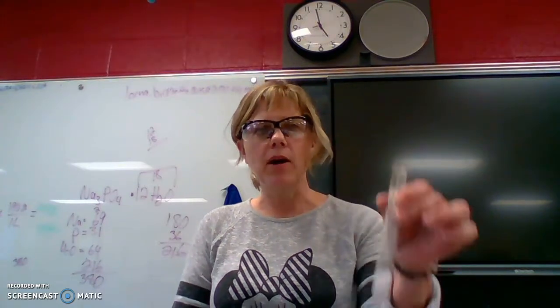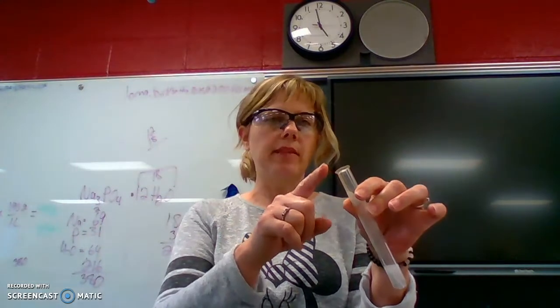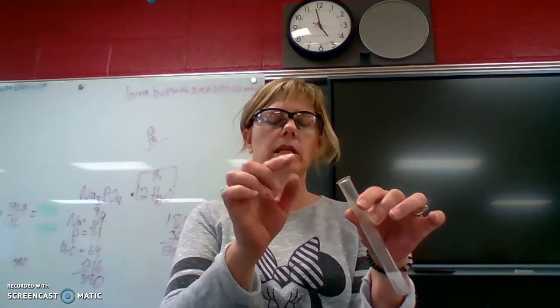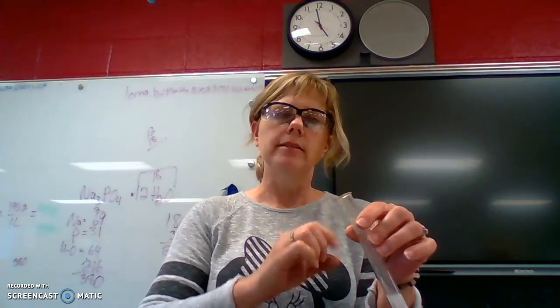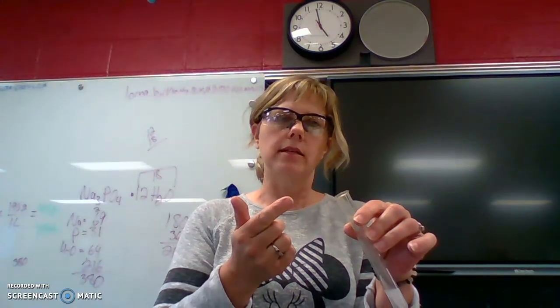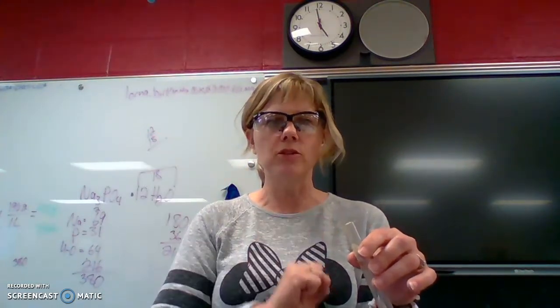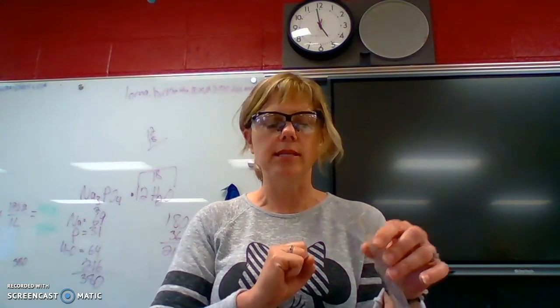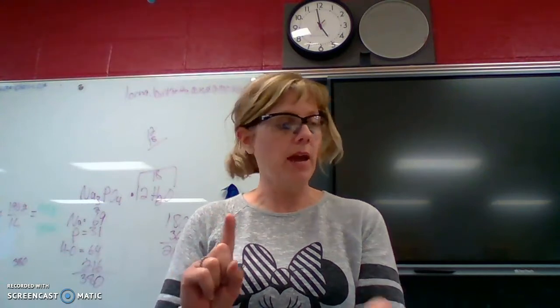So what we're getting in the mouth of this test tube with the lit splint, and it only happens at the mouth of the test tube because we need enough oxygen going in to support combustion to mix with the hydrogen gas that's produced, to produce just this little tiny explosion in the mouth of the test tube, which just sounds like that popping noise. So again, a super important observation that I missed.